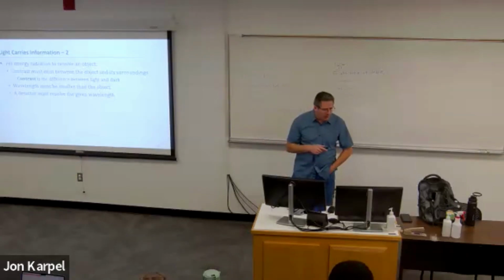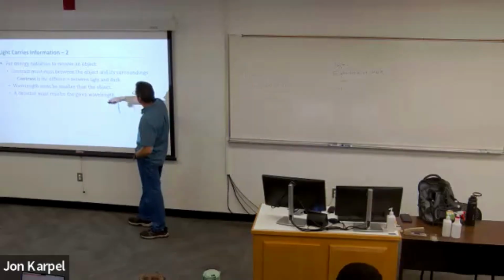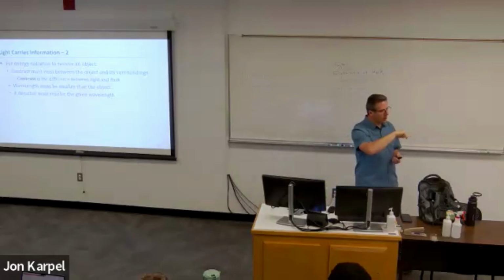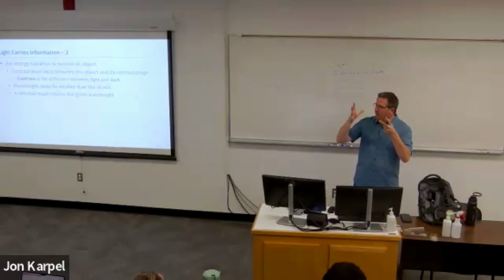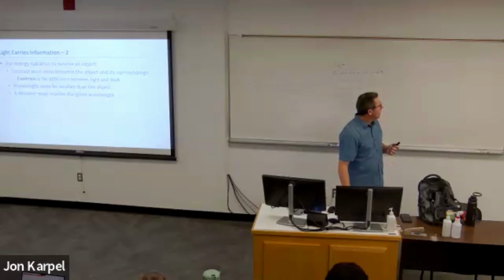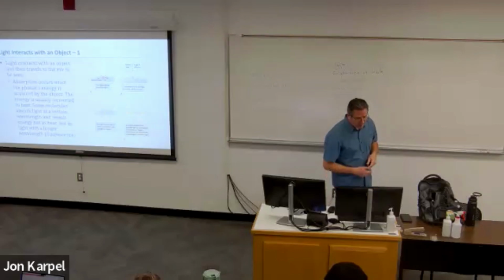There's a couple of different things that can happen when light interacts with these objects. And I'll teach you when we're in lab, or hopefully whoever's your lab professor will show you, how to adjust the contrast on these microscopes to adjust just the perfect amount of light that interacts with whatever organism you're looking at. So the microscopes are kind of cool in how they can work with whatever sample you're looking at, as long as it's big enough, I suppose.